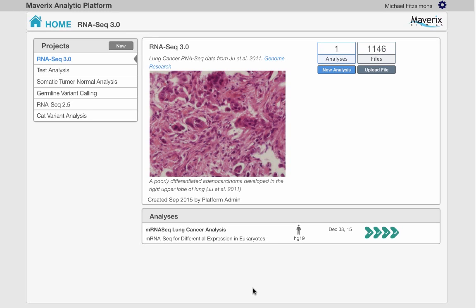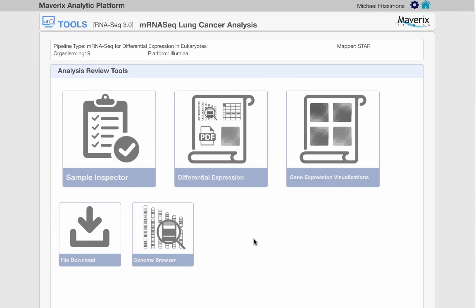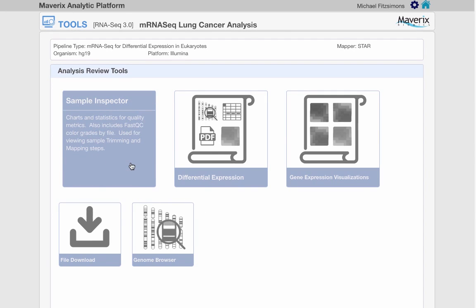The sample inspector can be accessed by clicking on the analysis results, followed by the sample inspector panel on the analysis review tools page.